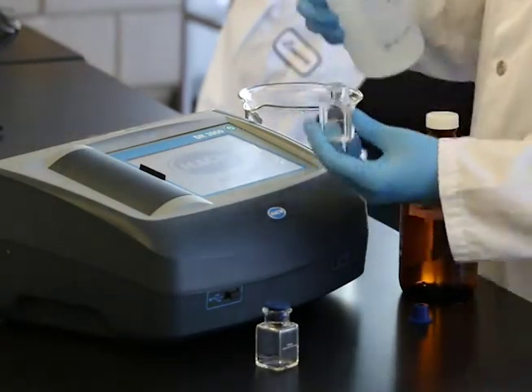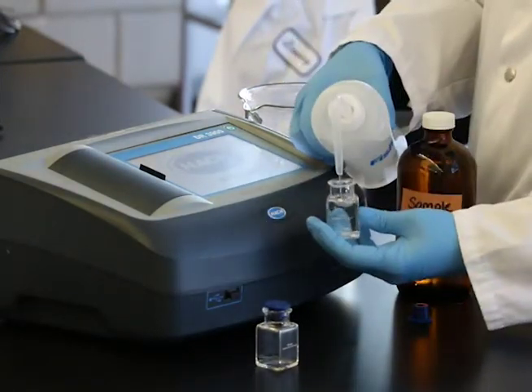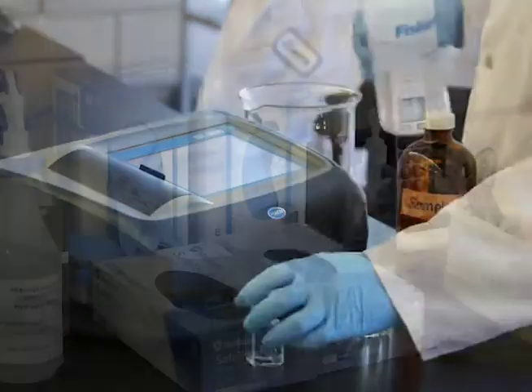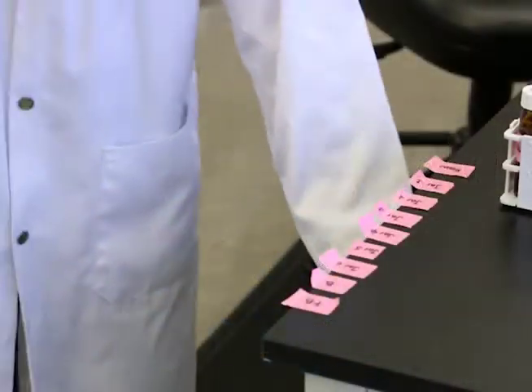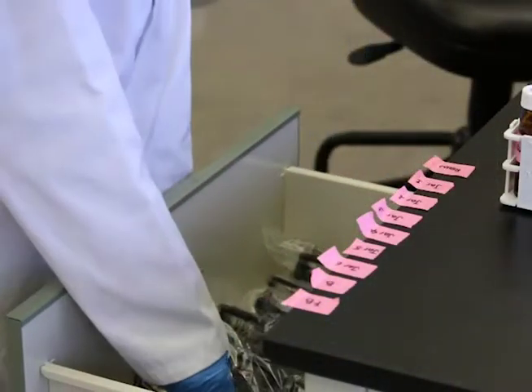You should always refer to the methods provided by the manufacturer of your equipment. It is important to review the safety data sheets for the chemicals that are used and to use the recommended personal protective equipment.